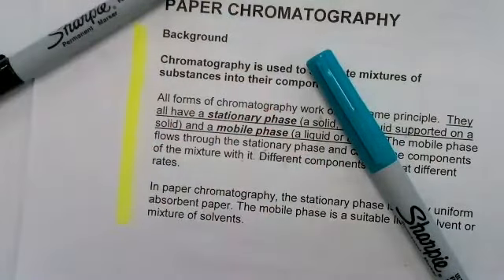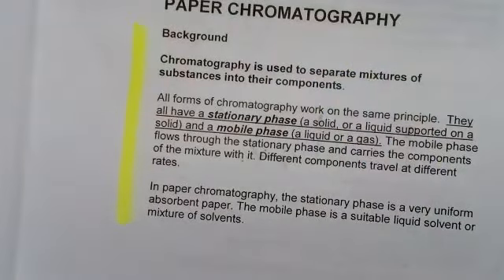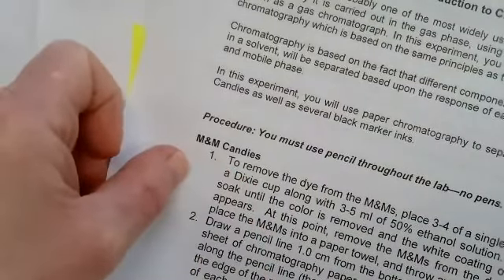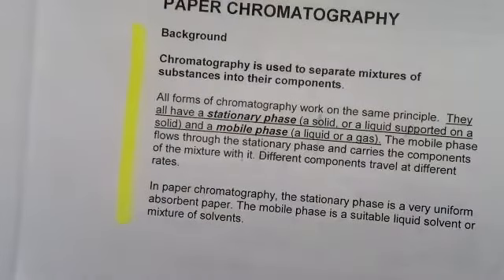So we're going to investigate marker and pen inks, but also, Mrs. Kendrick and I thought, be a little extra interesting if we investigated what M&M uses to make the different colors that we enjoy? So we're going to look at those kind of colors as well. So that's what we're doing.